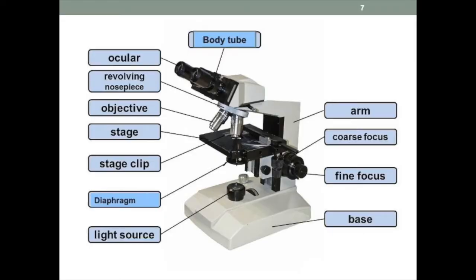If you rattle things in there, then it might break something inside. You want to pick up the microscope and move it closer to you. Pick it up by the arm and the base. Don't pick it up by anything else. Okay. Adjust the coarse focus knob. And then try to find out where your specimen is, try to focus on it, and then you can move your objective knob. You don't need to refocus anything.